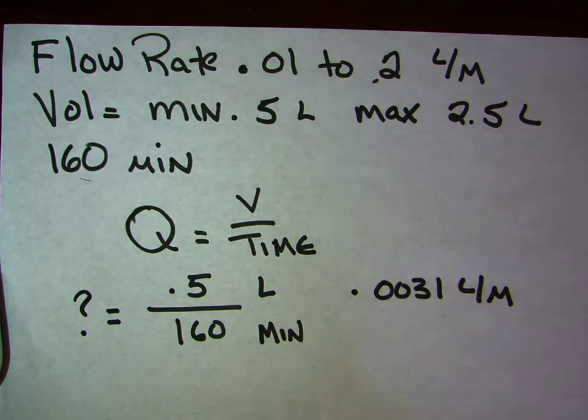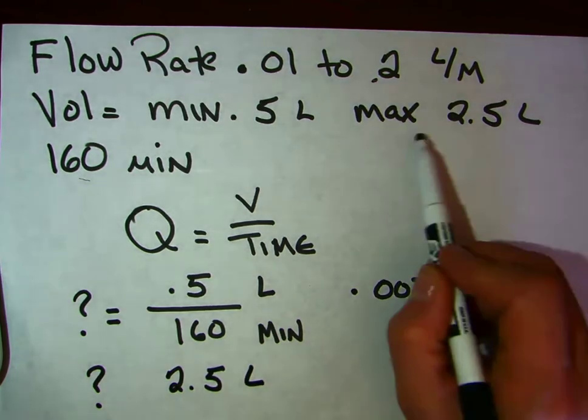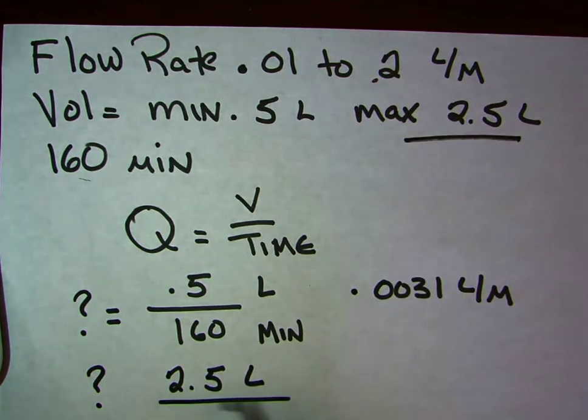So what's our maximum volume? Our maximum volume is 2.5 liters, maximum volume from our method, over 160 minutes.